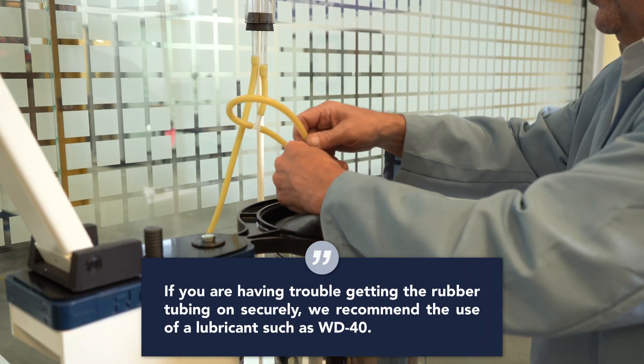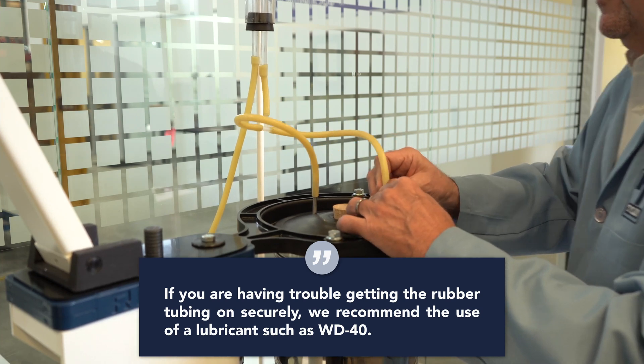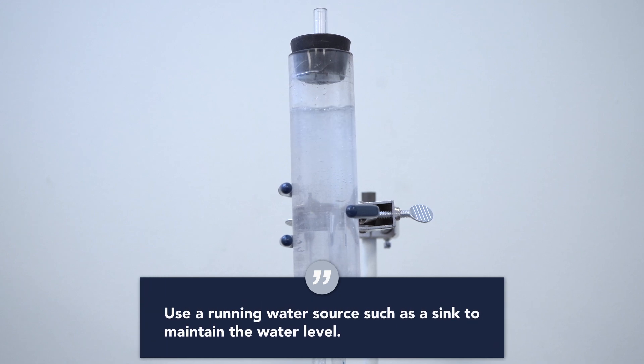Step eleven: attach the twelve inch tubes to the corresponding steel inlet tubes protruding through the modified cover. Step twelve: introduce water through the inlet rubber tube. Fill the flow meter assembly three quarters full. This level should be maintained through the duration of the test.